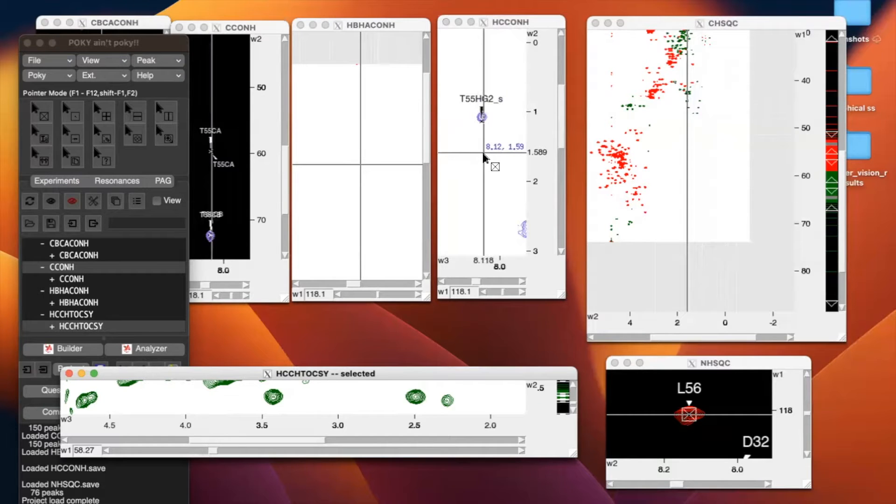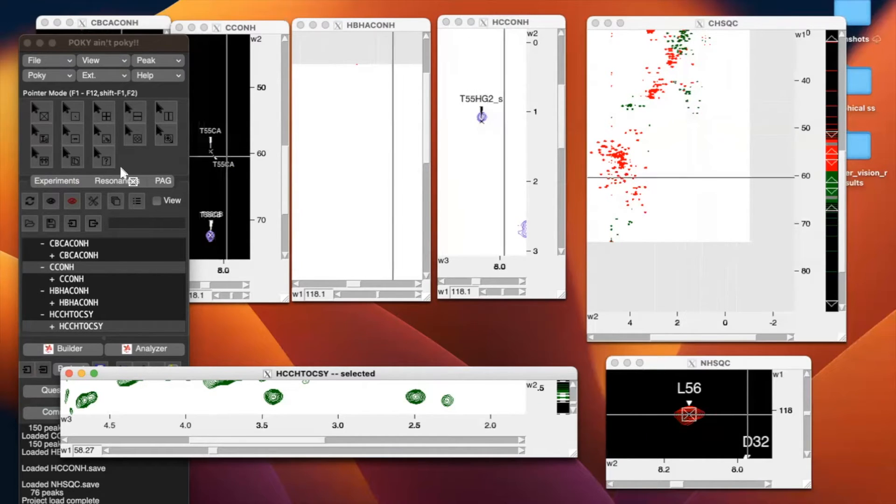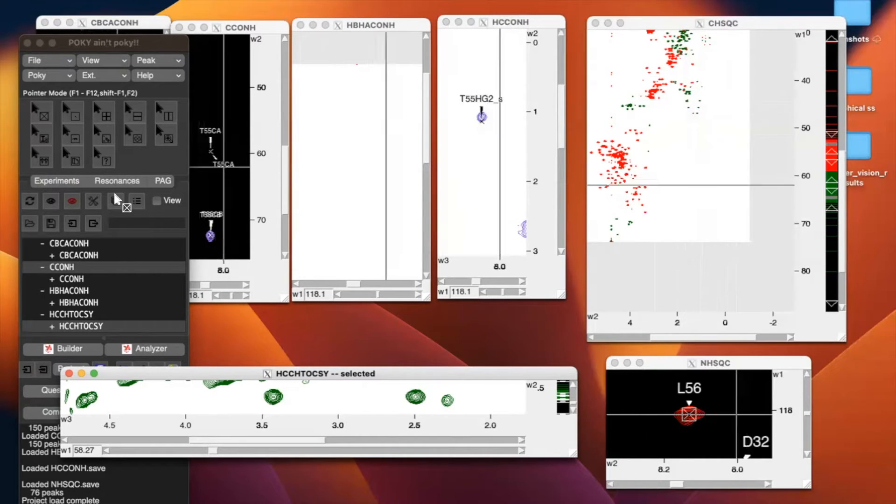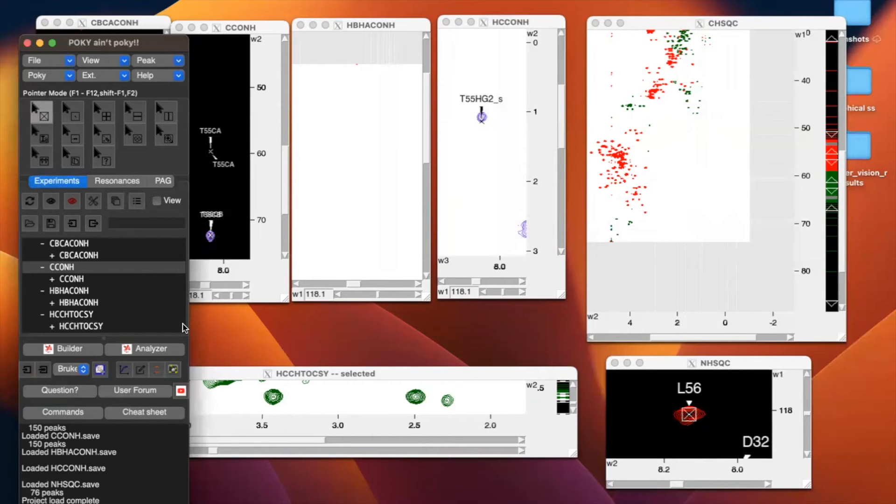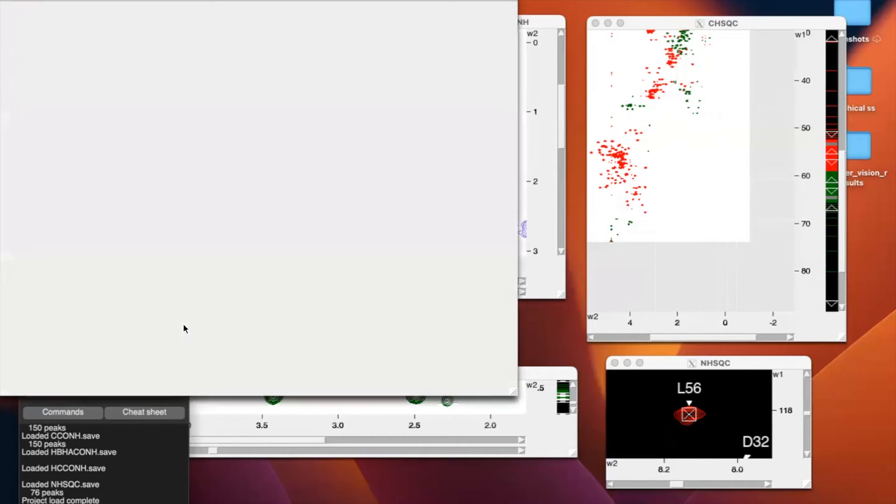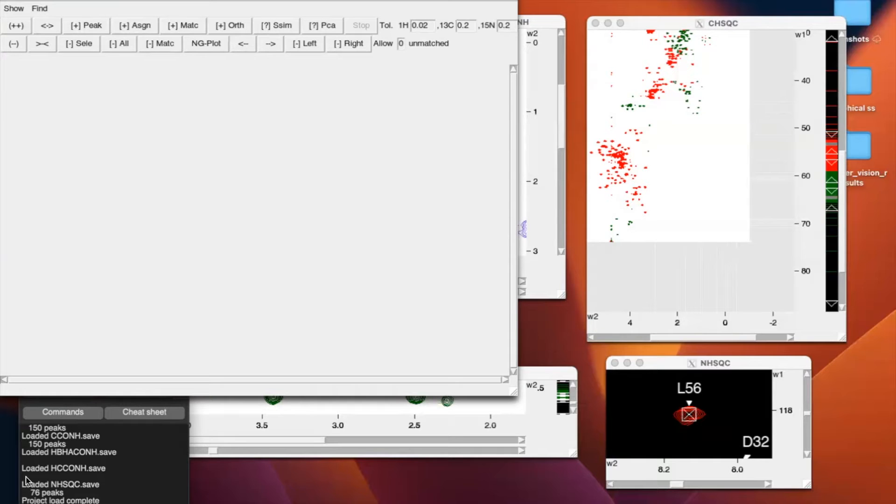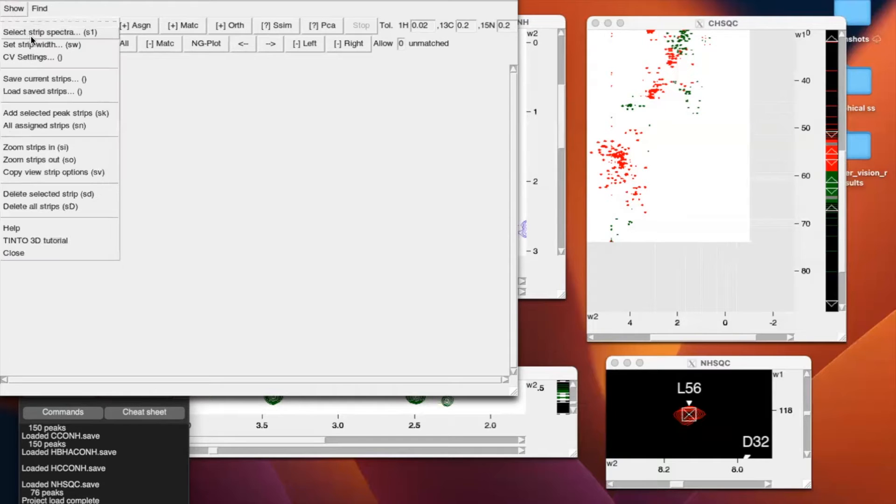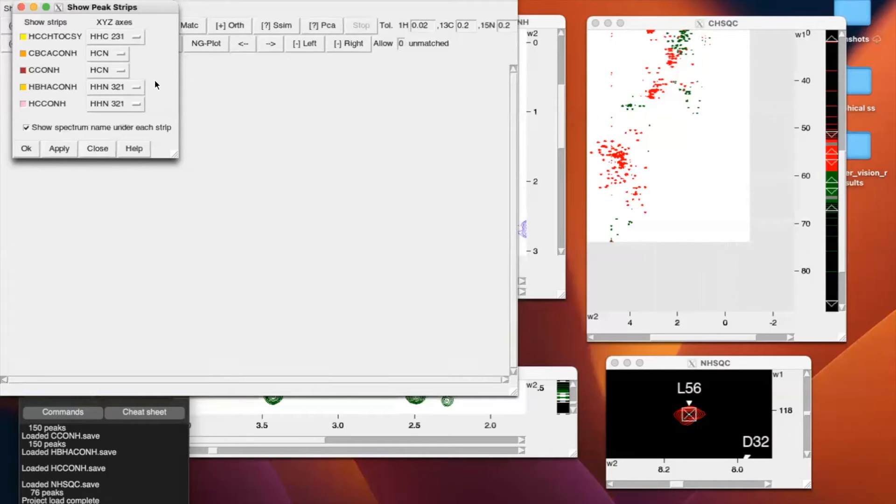Now that you have transferred and simulated assignments, we can set up our strip plot so that when we load our spectra, it's in the order we want and the spectra we want. So we're going to open strip plot with the two-letter code SP, and we're going to go to show, select strip spectra, and we're going to add the spectra that we want to load onto the strip plot in the order that we want.